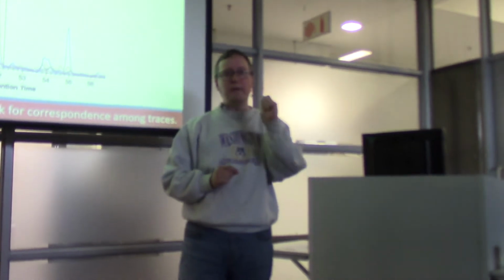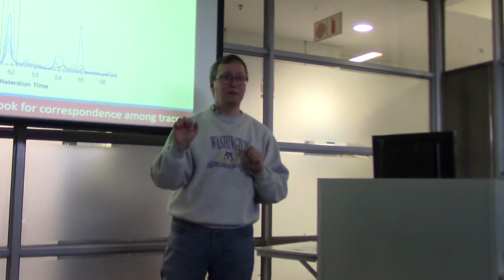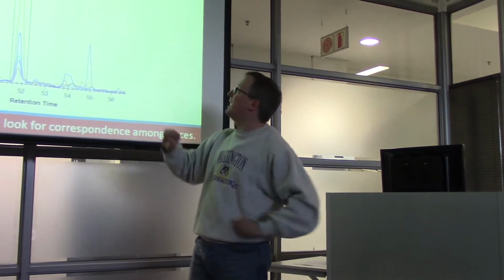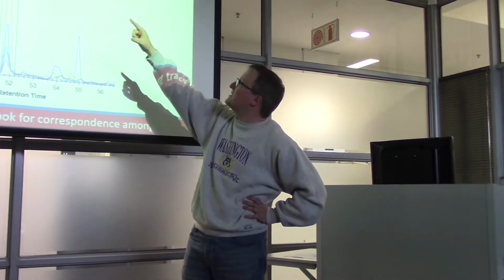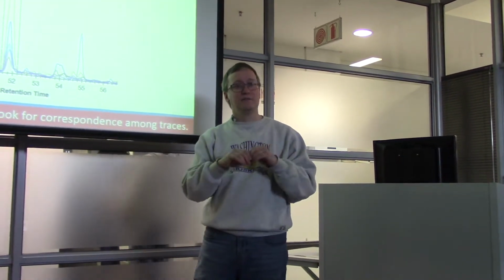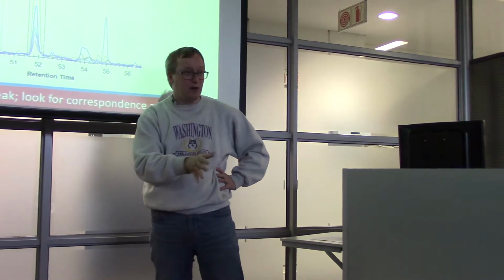This is one peptide ion that we are measuring 5 ways, right? We have 5 transitions that we measure for this individual peptide. You can see that they represent the Y7, the Y4, the Y6, the Y3, and the Y5 ions from this particular peptide sequence. We are glad to see that all 5 of these show up together.